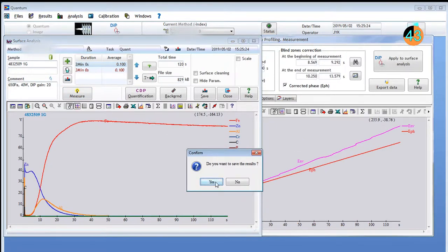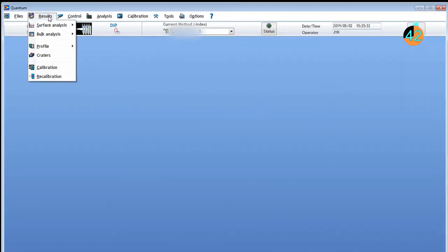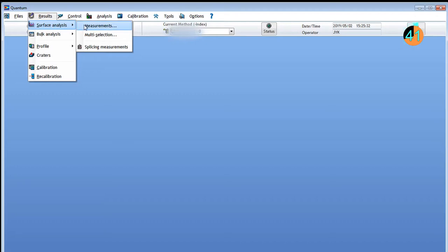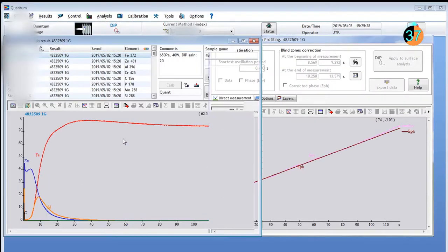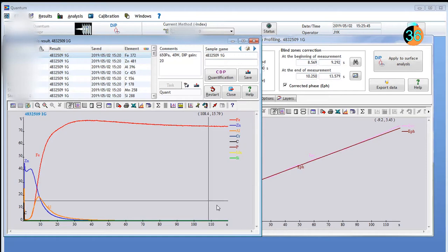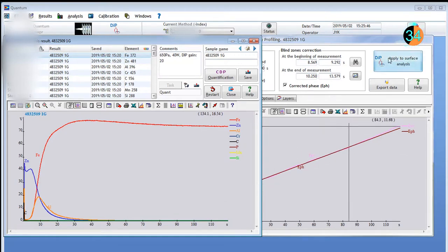After acquiring the data, the user can open the measurements for data processing in the database. The depth profile signals and the depth measurement by DIP are displayed on the screen.